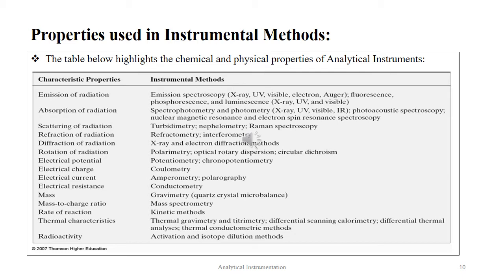Electrical charge, we use coulometry. Electrical current, we use amperometry and polarography. Electrical resistance, we use conductometry. For mass, we use gravimetry. Mass to charge ratio, we use mass spectrometry.